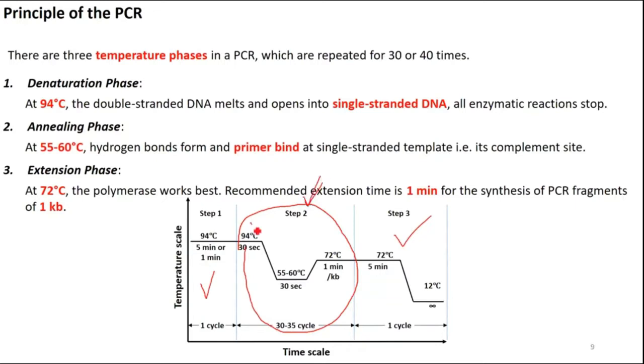And the third step that is also the principle of PCR is the extension step that is performed at 72 degrees centigrade. If this step is longer, like 18 minutes for longer extensions of DNA fragments, sometimes we decrease this temperature to 70 degrees centigrade and even 68 degrees centigrade in some cases, but usually we perform routine PCR at 72 degrees centigrade. Some of the fragments that miss the opportunity of full extension are given an extra extension time of 5 minutes, and at the end the final PCR reaction product is stored at 12 degrees centigrade in the machine.